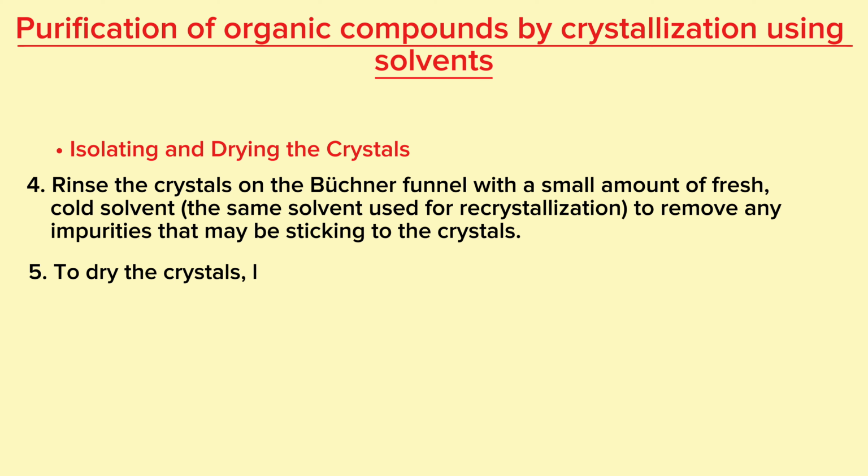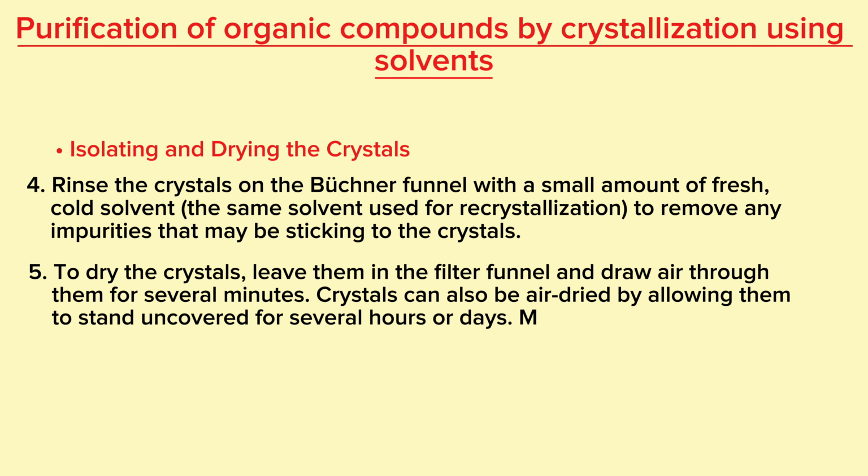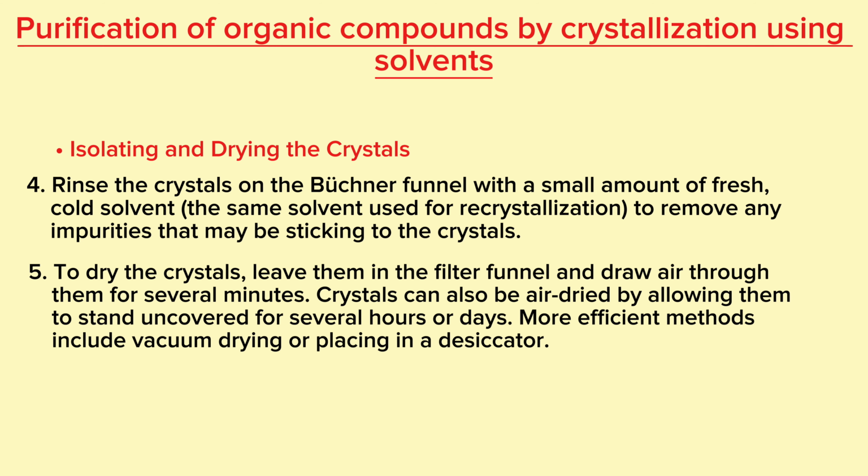To dry the crystals, leave them in the filter funnel and draw air through them for several minutes. Crystals can also be air-dried by allowing them to stand uncovered for several hours or days. More efficient methods include vacuum drying or placing in a desiccator.